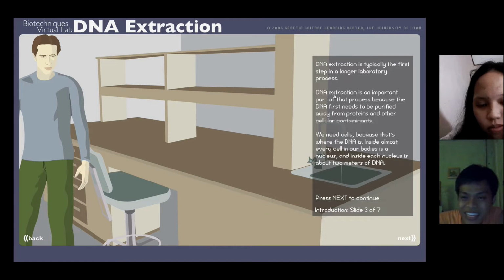Si Rowena, makabasa ka dito sa description? Sa right side. Wala si Rowena. Ikaw na lang ulit, Texie. Go.